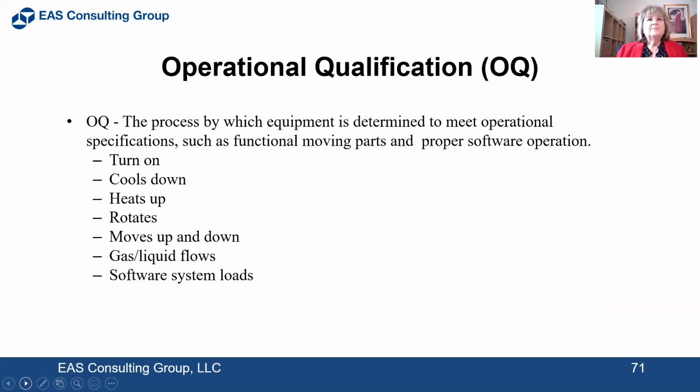Your OQ, your operational qualification, again, is pretty simple and straightforward in that protocol. You're just going to see if the power comes on, if it cools down if it's supposed to, if it heats up if it's supposed to, if it rotates, if it moves up and down, that you have gas or liquid flows, that your system software loads, that type of thing.